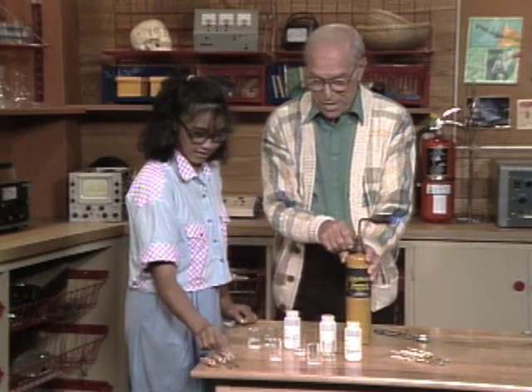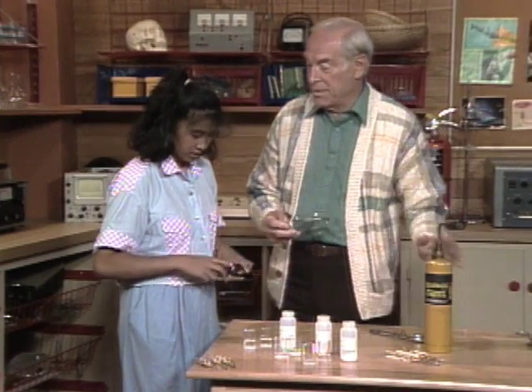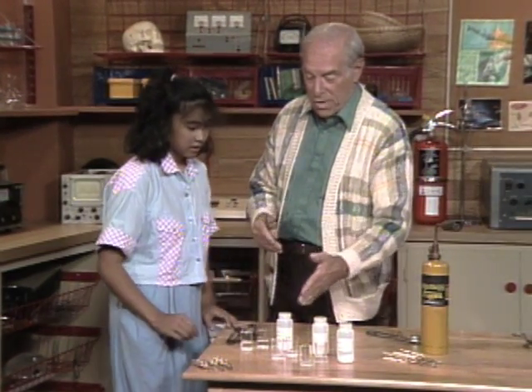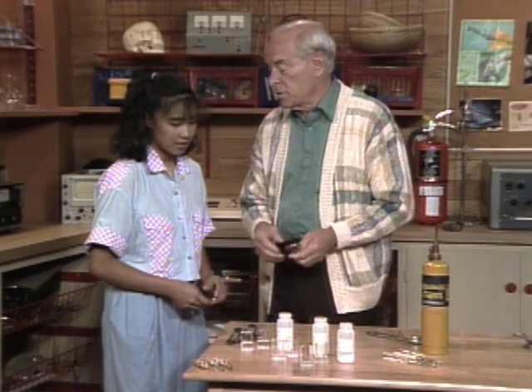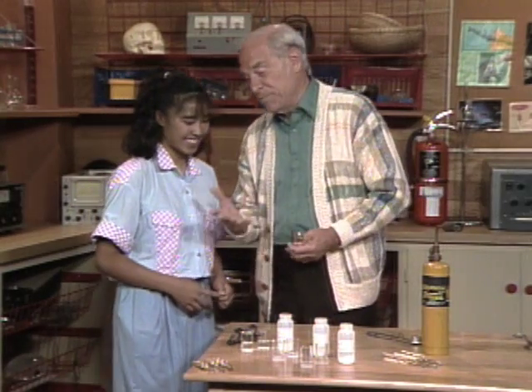Very good! So now you see how you've been an analytical chemist, using a flame test to identify three unknowns. Chemists use this all the time, so you can tell your teacher you are now an analytical chemist — at least a beginning one.